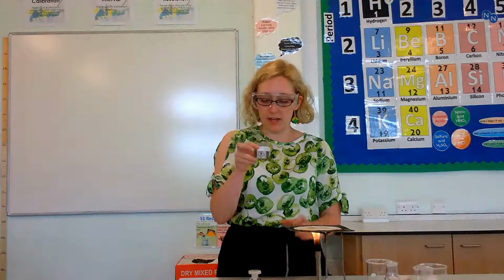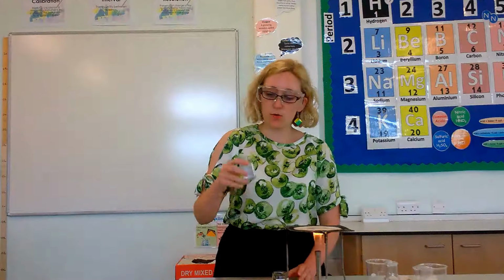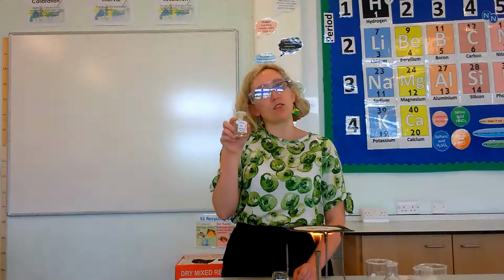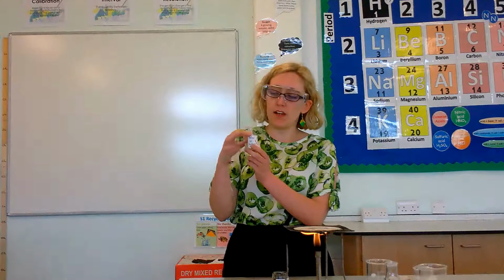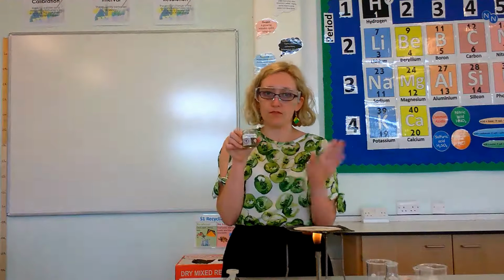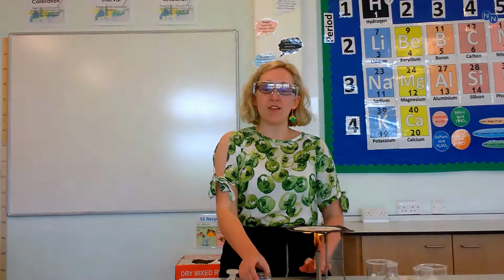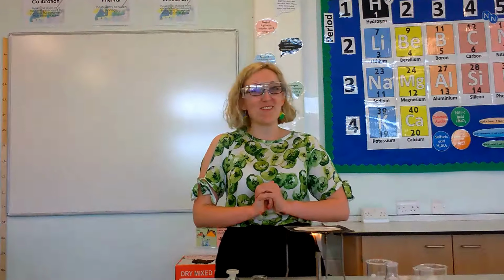You're also going to need some copper 2 oxide powder with a spatula to pick it up with. You will need 40 millilitres of 1 molar sulfuric acid. 1 molar means that's the concentration. It's 1 mole per decimetre cubed. And that's also an irritant, so we need to be very careful when we're handling these chemicals. Copper oxide, also irritant and hazardous to the environment. So, fairly dangerous stuff. We're not going to be pouring any of this down the sink. We're also not going to be pouring any of this all over our hands or all over our friends, because that wouldn't be very friendly.